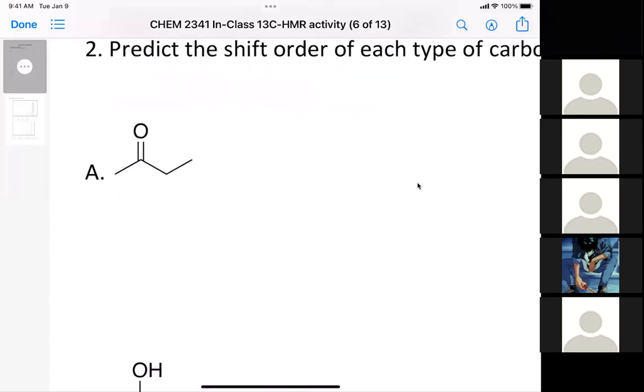So when we did this molecule here with proton NMR, we only had 3 signals. Oh, it's still not there. Display on. There. All right, sorry. So we had 1 signal here, 1 here, and 1 here for proton NMR, but we have a carbonyl. Don't forget the carbonyl when you talk about carbon NMR. So we have A, B, C, and D.